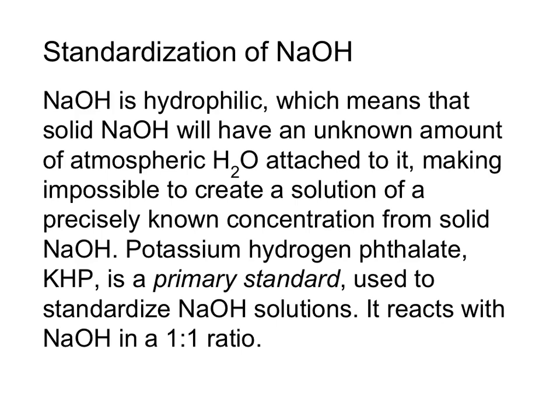The standardization of an NaOH solution is a fairly common tool that's used in labs. Sodium hydroxide is what we term hydrophilic, which means that it is water-loving. This results in solid NaOH having an unknown amount of atmospheric water becoming attached to it. And since we don't know how much water might be attached to it, this makes it impossible for us to create a solution of a precisely known concentration from solid sodium hydroxide. We can come close, but we don't know what the exact concentration is because we don't know how much of the mass that we have weighed out is a result of that attached water.